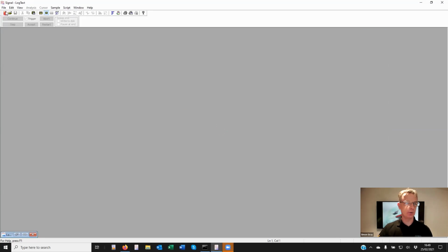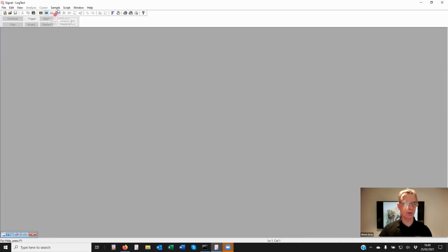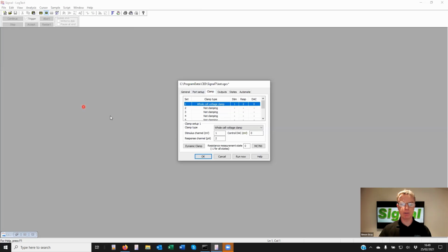A little bit of time to talk about the voltage clamp stuff we can do. If we go to your clamping tab, you specify whether you want whole-cell current clamp, voltage clamp, or single channel voltage clamp.